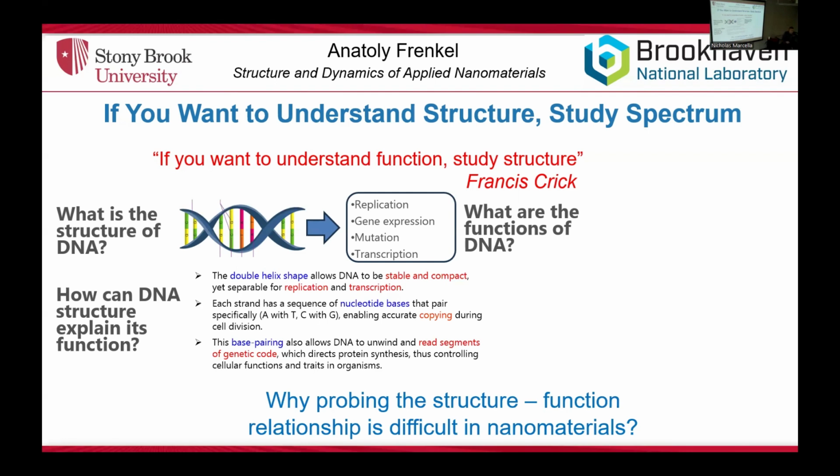I'm bringing you to the case of why you need X-ray spectroscopy. It's not just general thoughts about something unrelated. So we're coming there. The question that we ask when we try to understand the mechanisms at the nanoscale is of the same nature. What are the structural units, descriptors, responsible for the material's functionality? Because of the lack of periodic structure, because of the lack of simple descriptors such as the four nucleotide bases, we have some unknown field to deal with.